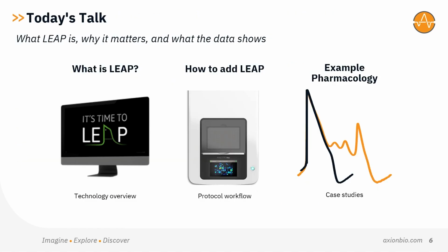Now that we've established a solid foundation of the importance and utility of studying the cardiac action potential, let's now delve deeper into the details of the LEAP assay. First, we'll define what LEAP is and how it works. Then, we'll talk about how LEAP fits into the standard MEA workflow. And finally, we will look at example pharmacology data showing how LEAP captures expected changes in action potential morphology.